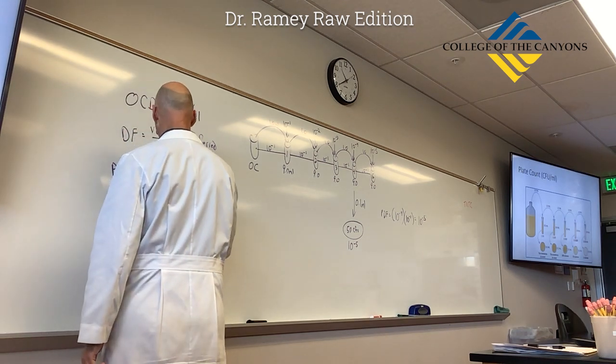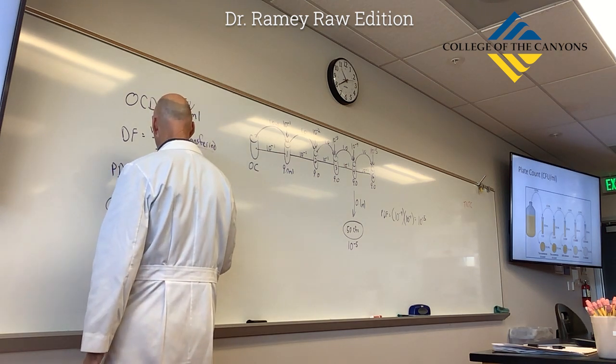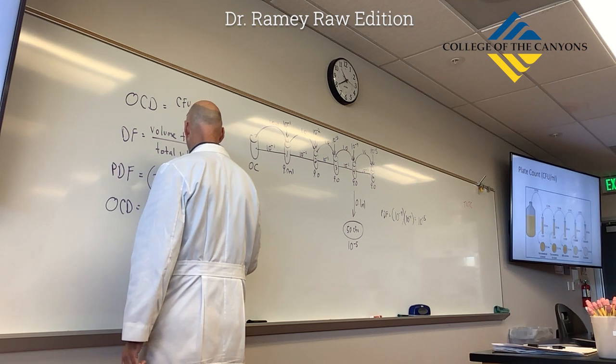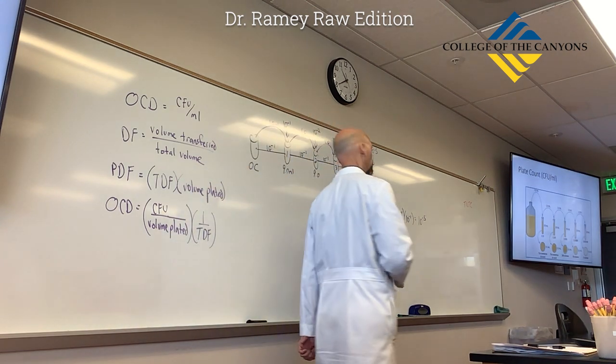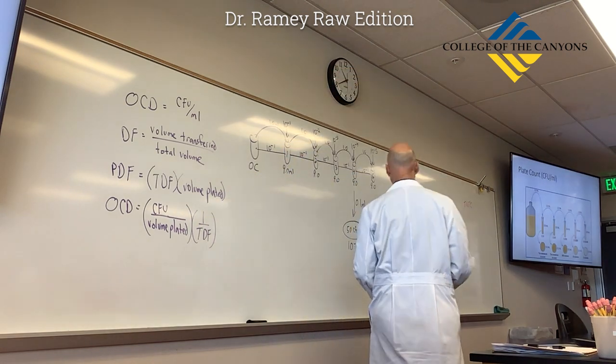CFU over what? Over volume plated times 1 over the total dilution factor of the dilution tube. Right? So, okay.